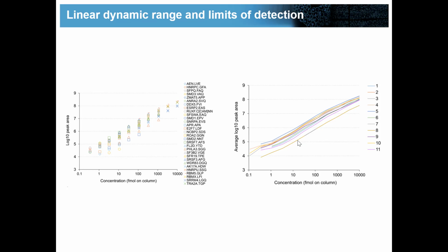So most of the time we do label-free quantification, which means we do one injection of each sample, and we compare the peak areas from the first injection to the second injection and make a ratio or something like this. And you're right, we definitely can't do iTRAQ because the isolation windows are so large. It's the opposite of what you want with iTRAQ, right? With iTRAQ you want to have very well isolated precursors.